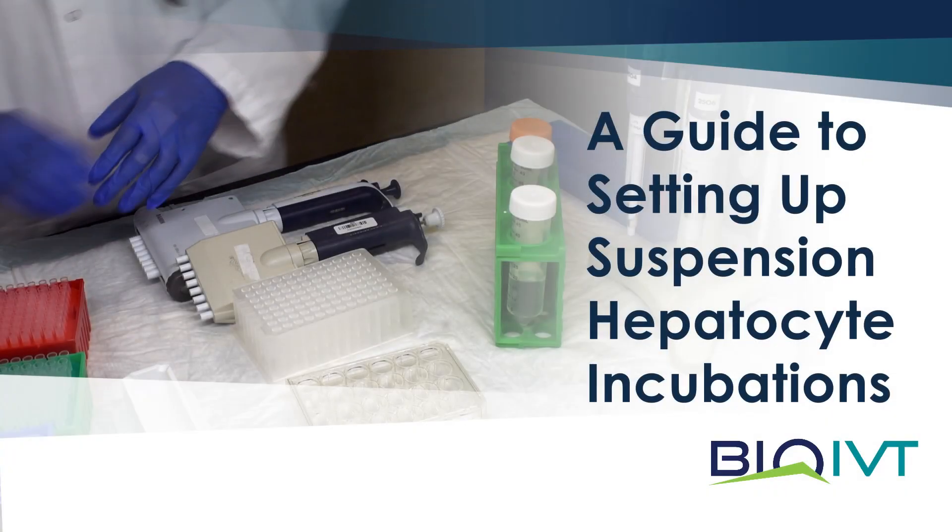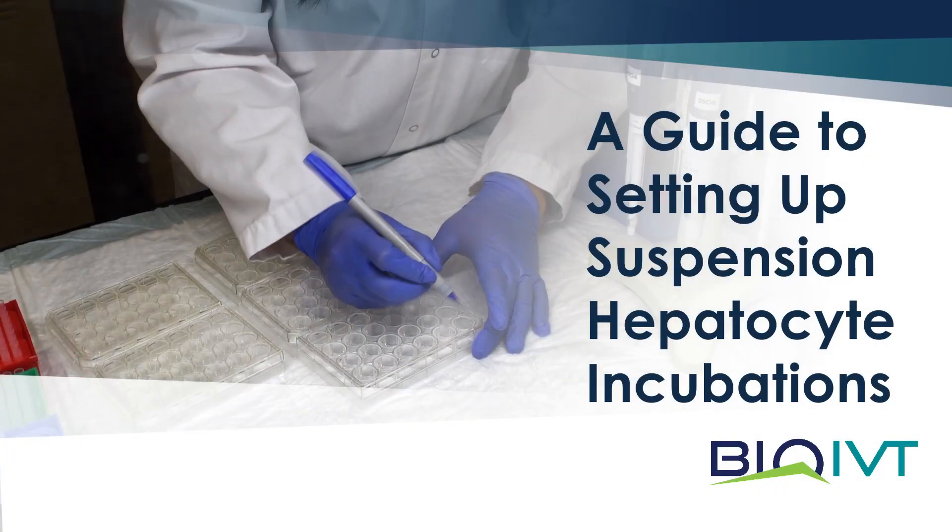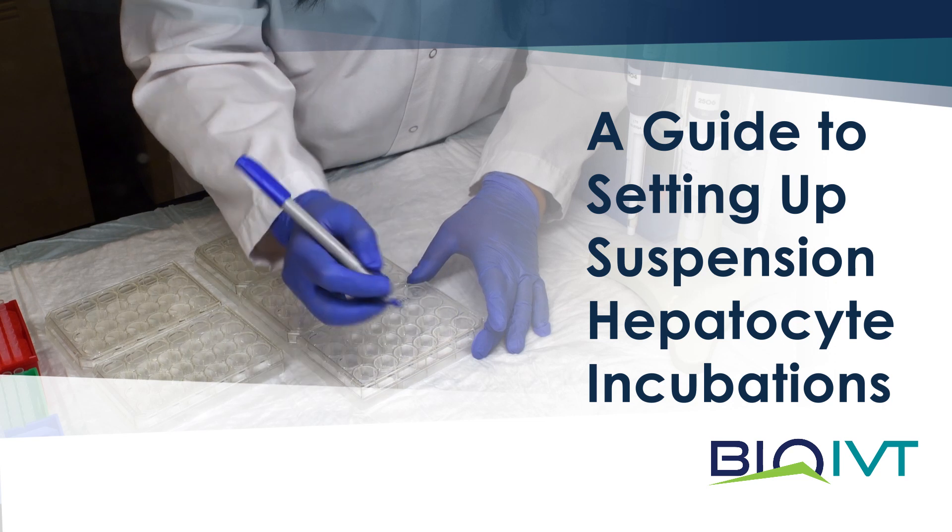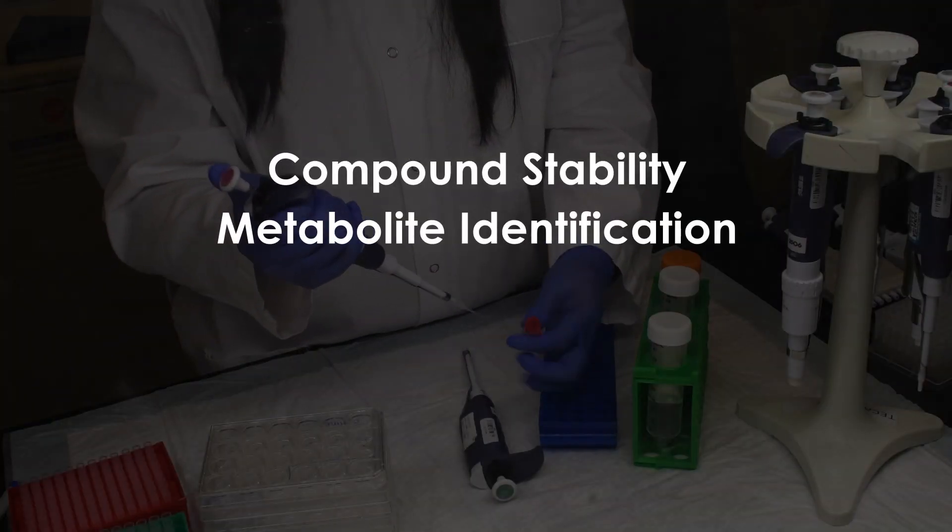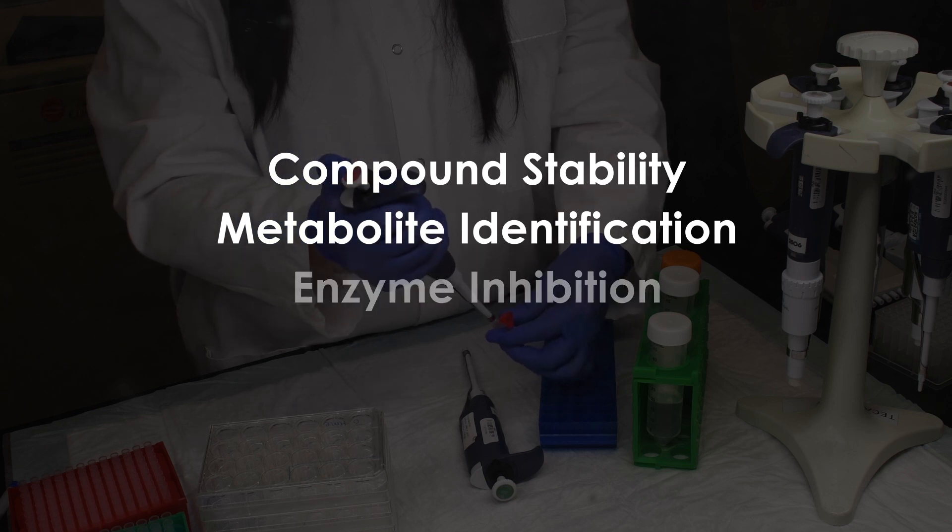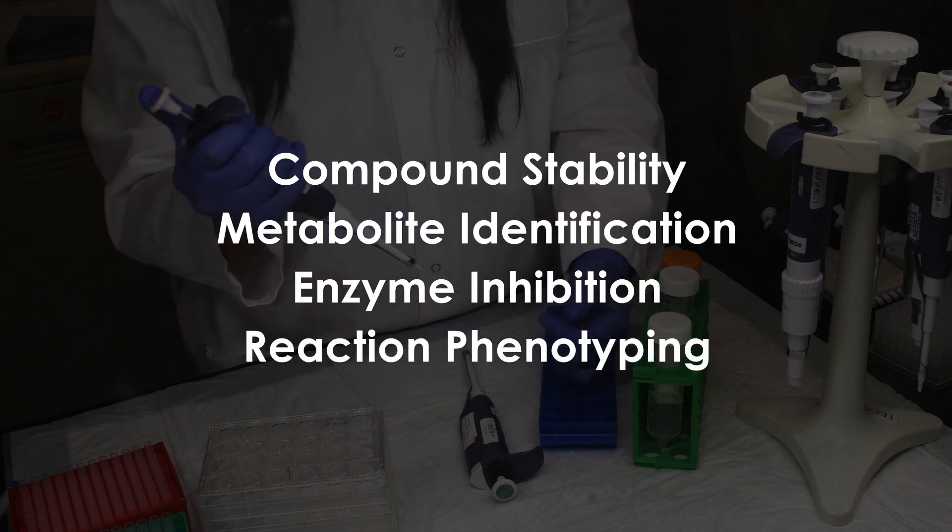In this video, we will demonstrate how to set up and run suspension hepatocyte incubations for metabolism studies. These commonly include compound stability and metabolite identification assays, but can also be modified for inhibition and reaction phenotyping studies.